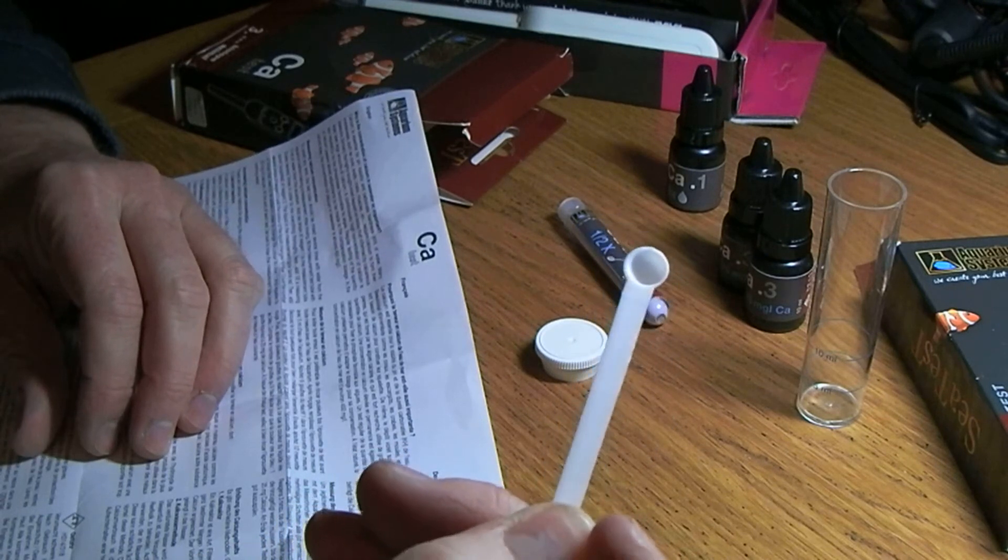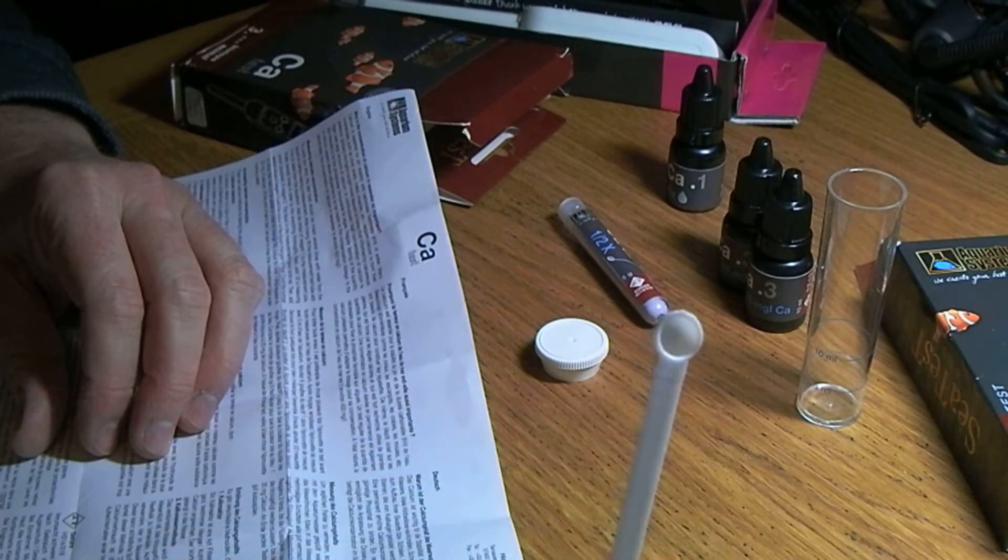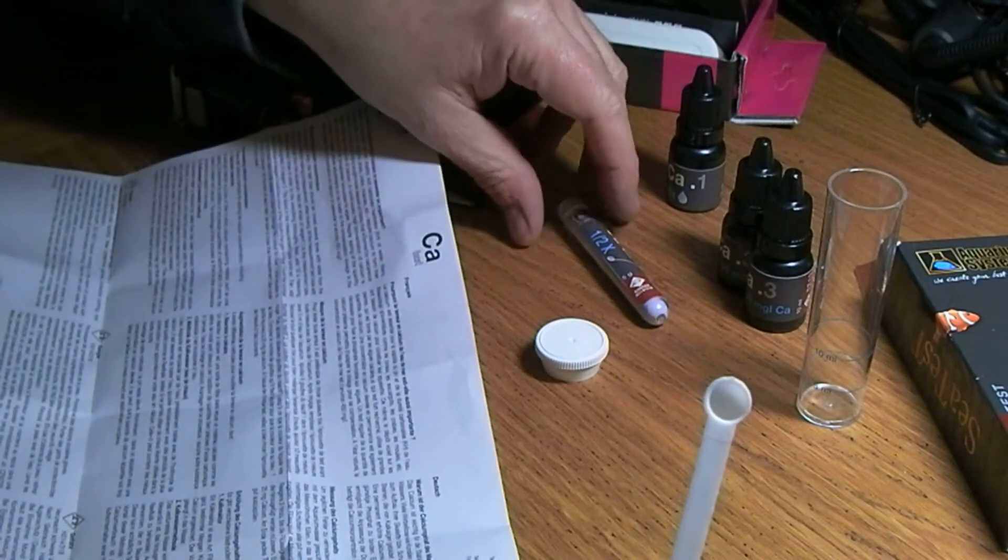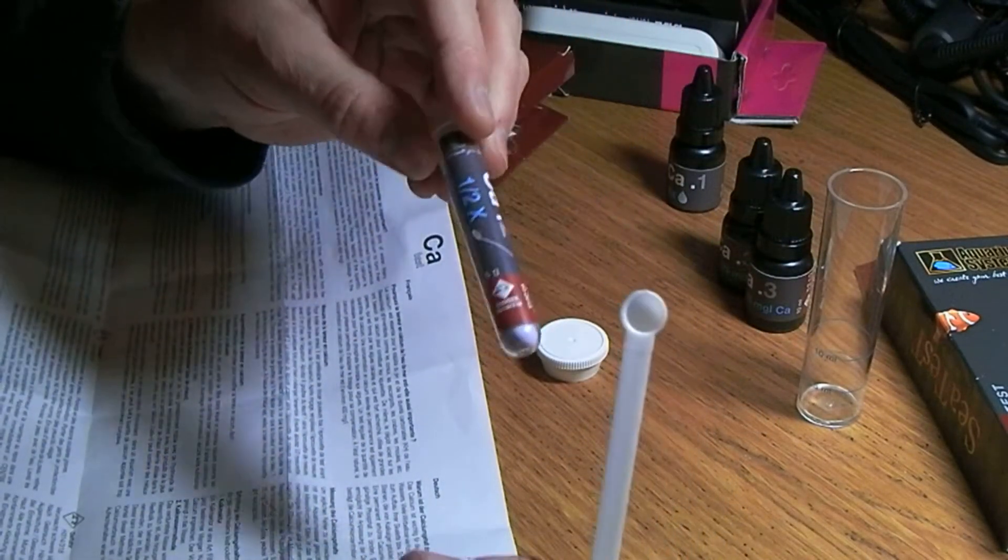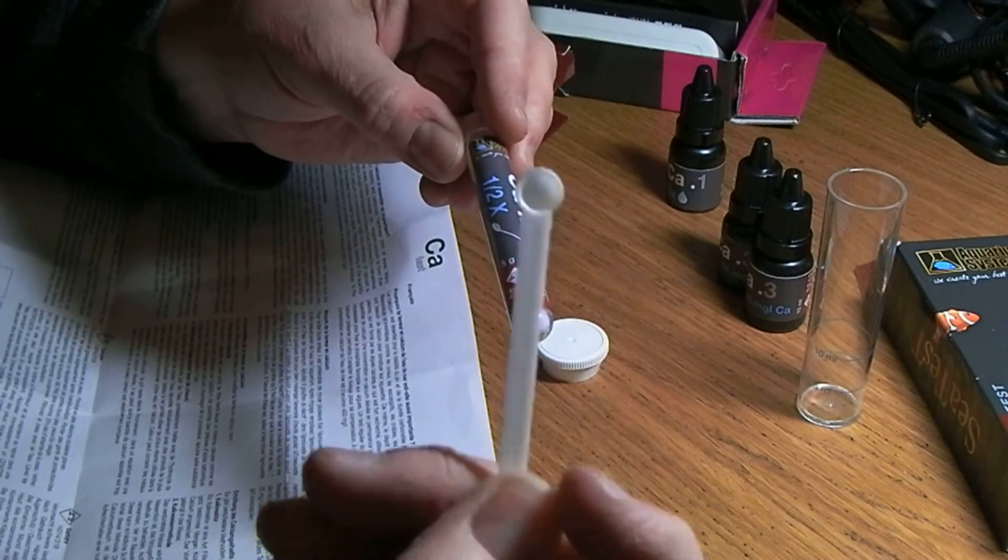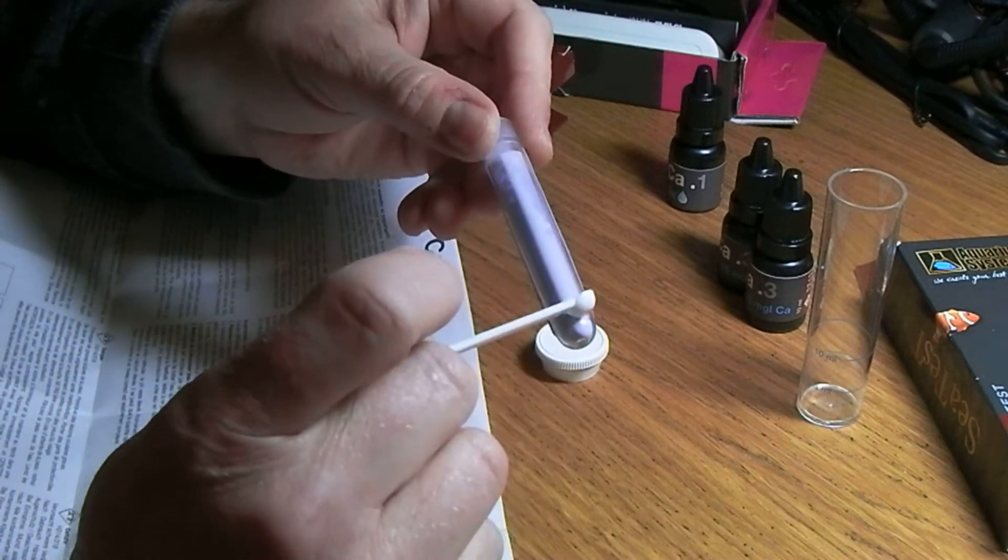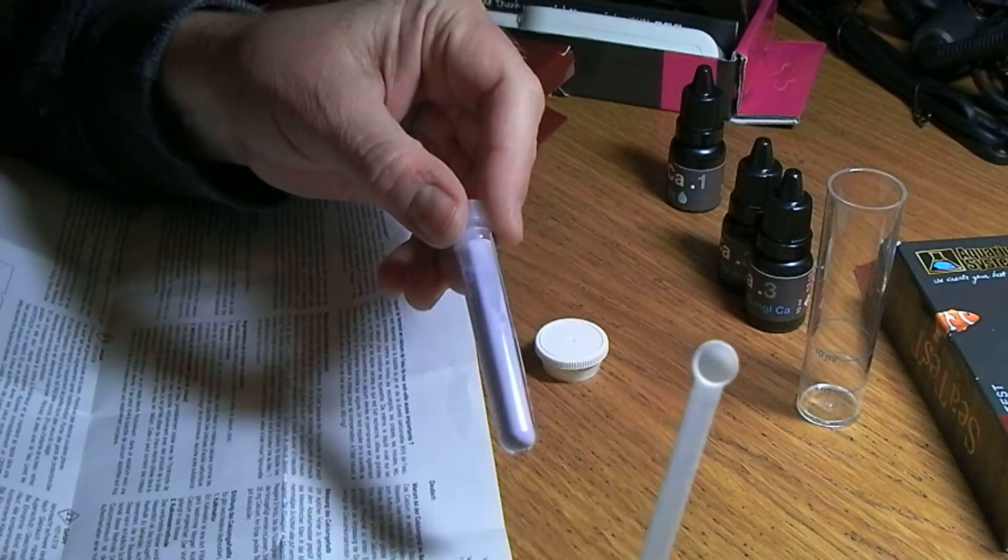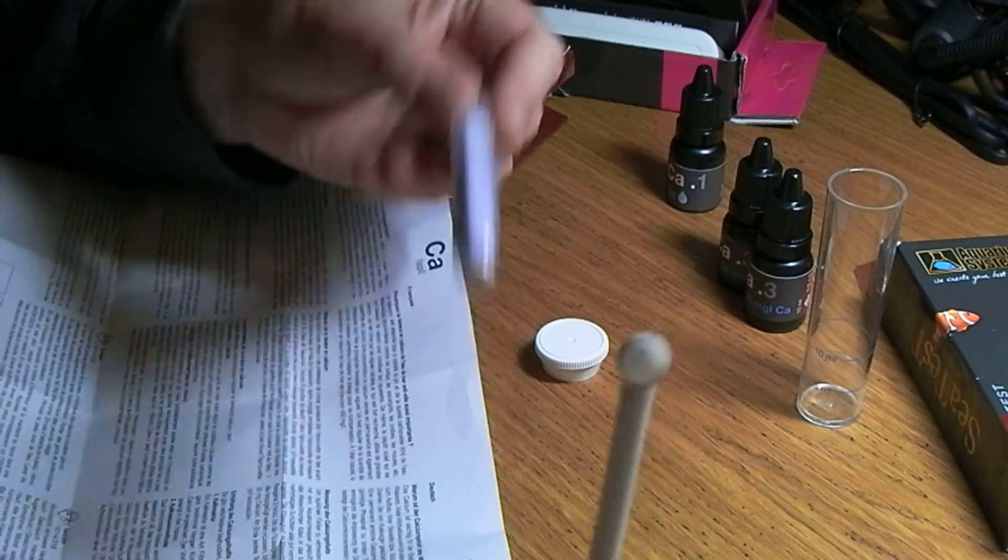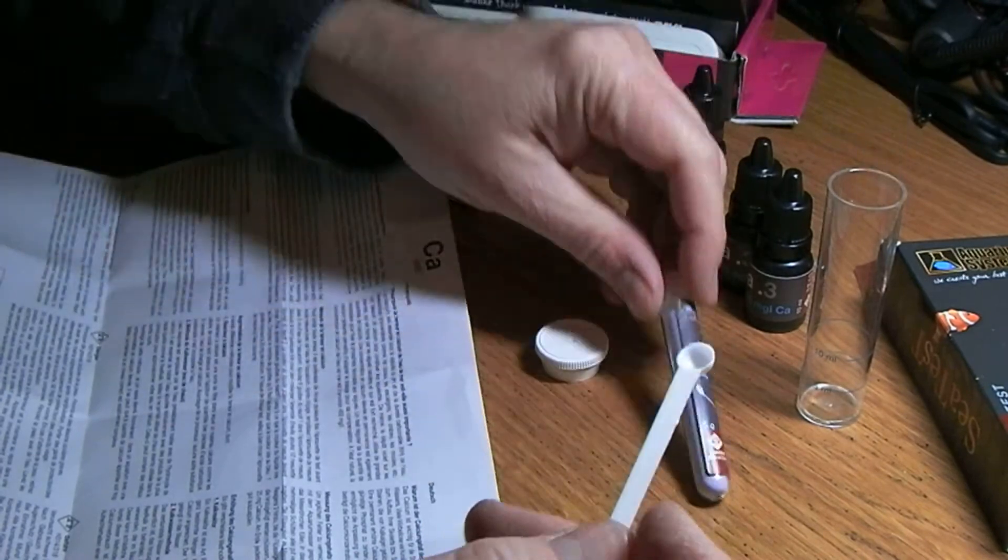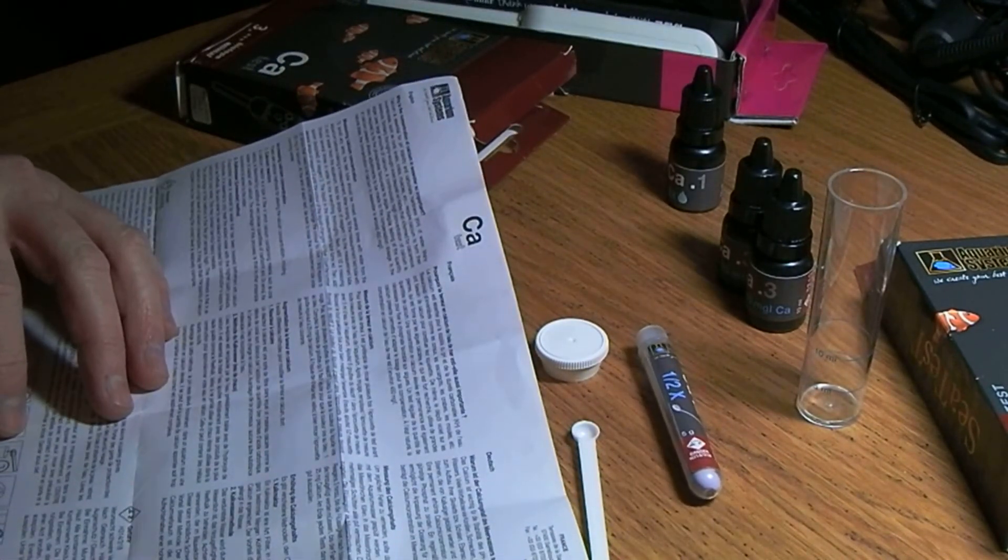Now tell me how you get half a spoon of powder in there. I find it hard enough to get a level spoon for the other test kits, the Red Sea ones that I've got. So why didn't they just make it smaller so it was one for one with the powder. Whether you can see, it's really really fine, so it would have been quite easy to get a smaller spoon of the right quantity. I see no way that I'm going to be able to work out half of that. That's ridiculous.